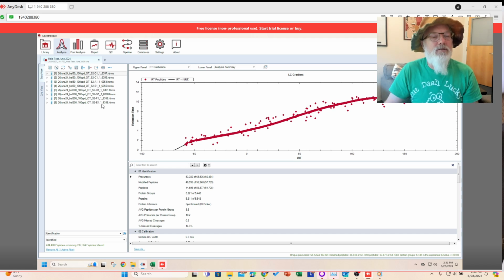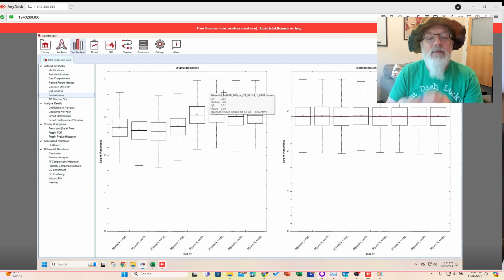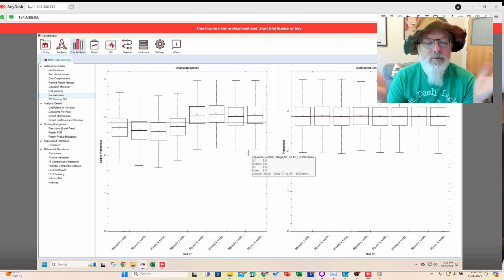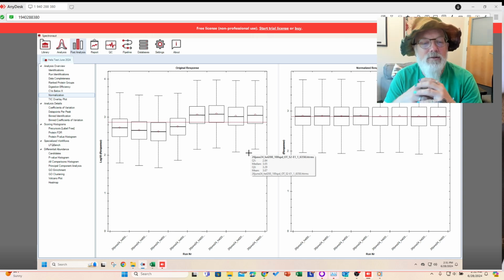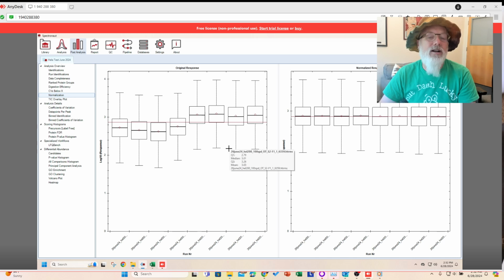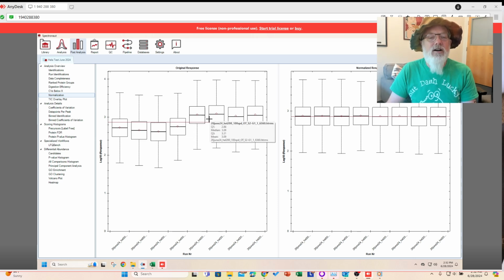Just to give you a little background on what normalization is. You can see it under post-analysis normalization. Basically, it tries to correct for differences in loading. Usually in a proteomics experiment you try to load the same amount of material, except if you're loading by volume, doing affinity purification, or other experiments where you're not going to load equal amounts. But for the most part, you load equal amounts. So this corrects for pipetting errors or other errors in your protocol. Maybe your robot is pipetting things a little differently.